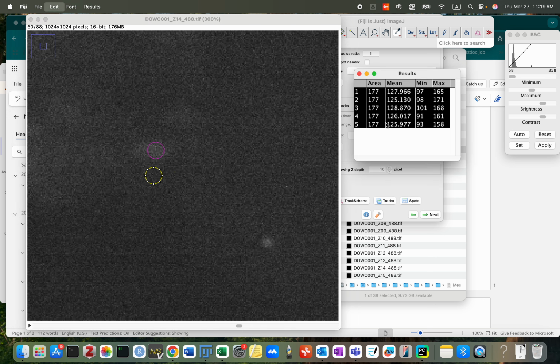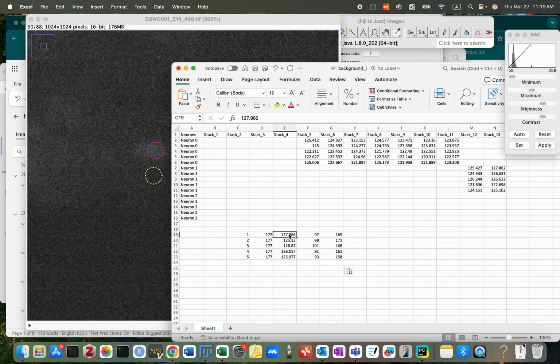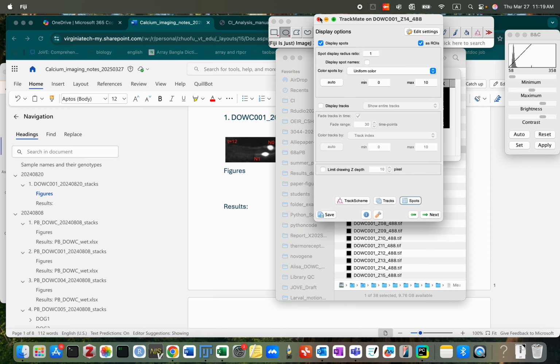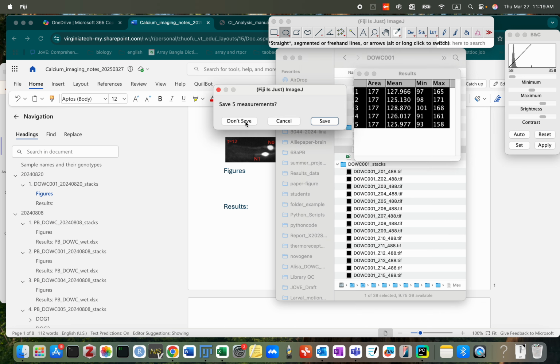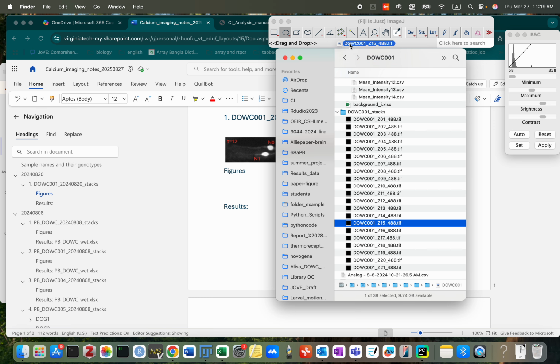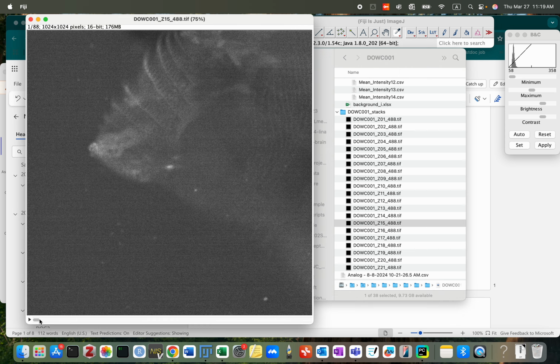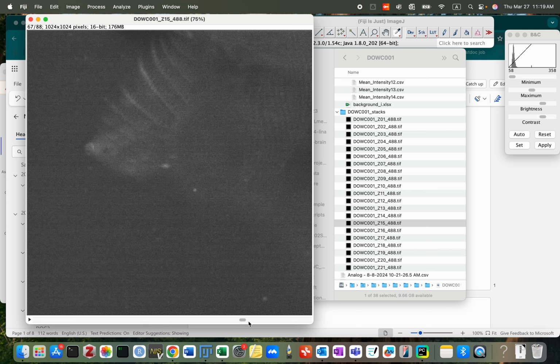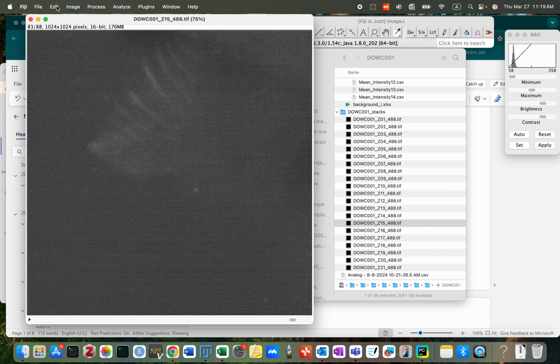Background data. Z stack 14. Good. Close. Close. So I think we don't need to work on 15 anymore, but let's check it again. Yeah. You see the contrast has changed, and no brighter point shows. Okay, we stop at this point.